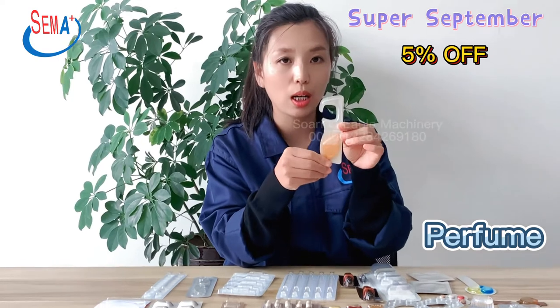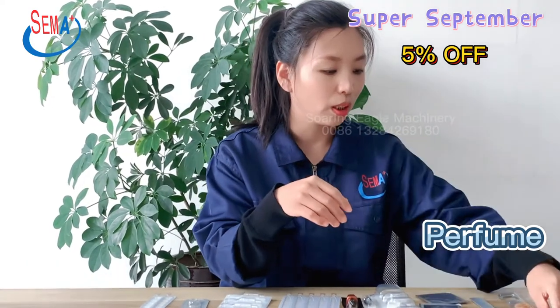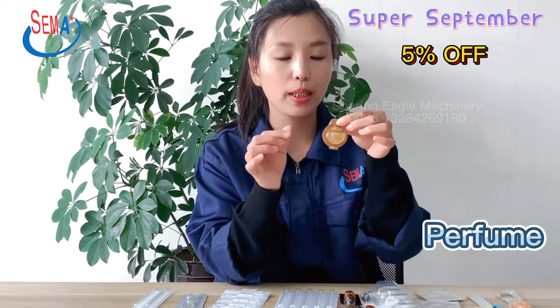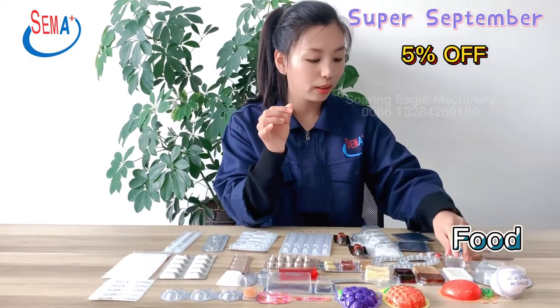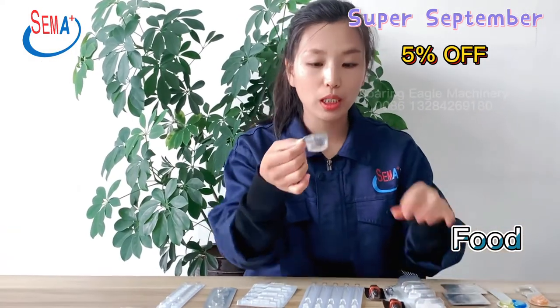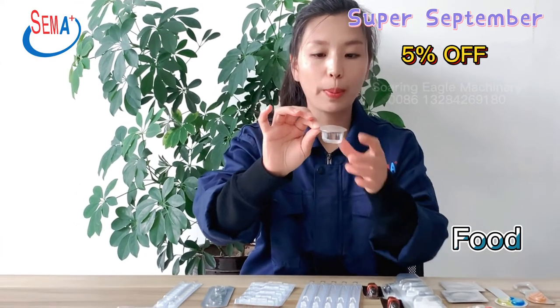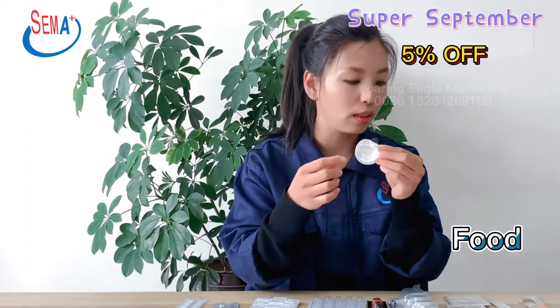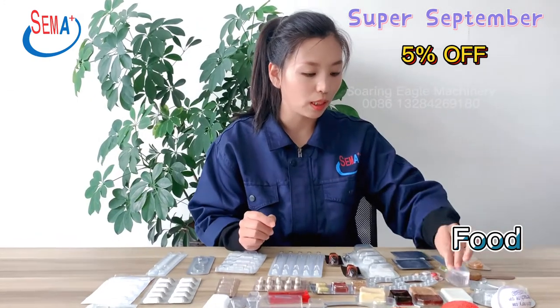This one is specially made for our car customers. It also has a round shape, and this part breaks off like this. And this is for oil packing — 15ml oil packing. The top side has an easy open notch, and the back side has embossing for the date or the batch number.